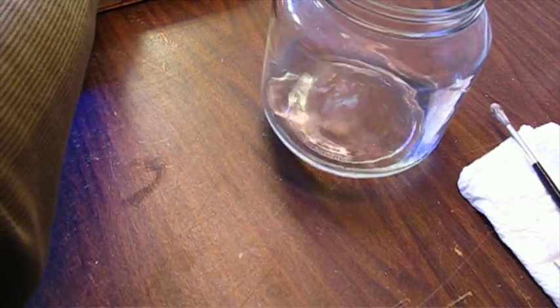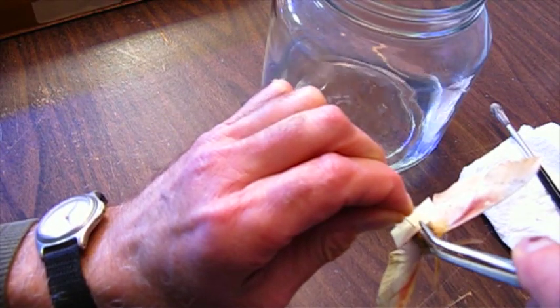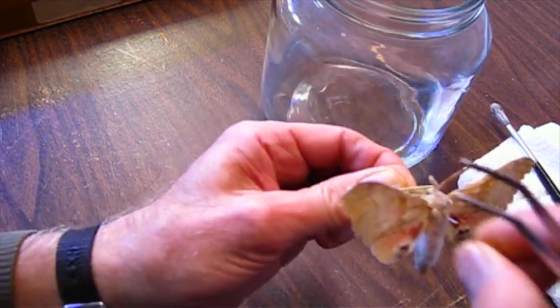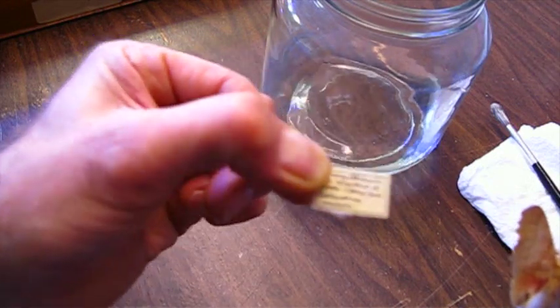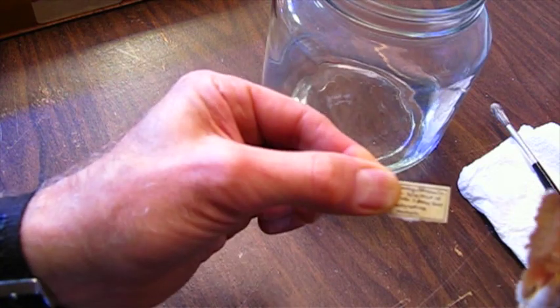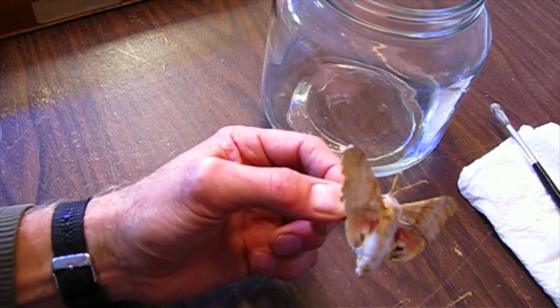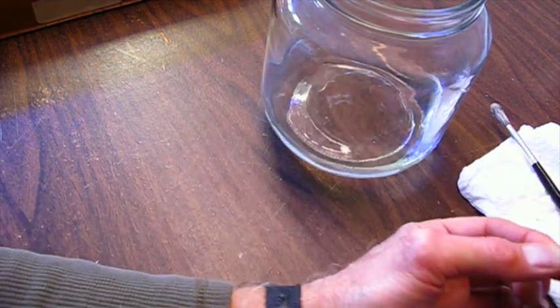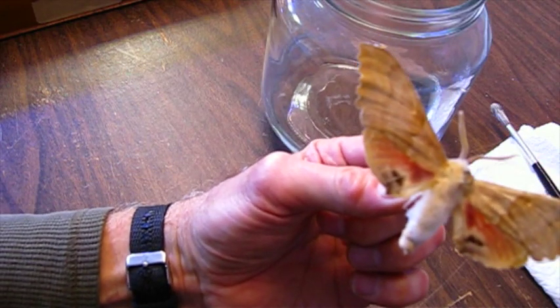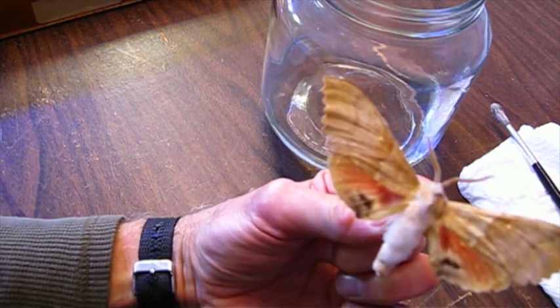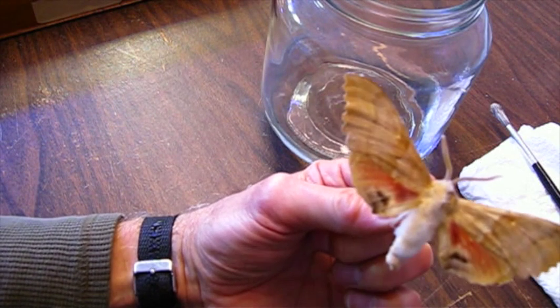First thing to do is I'll remove the label, the data label from the specimen. You can see even the data label has some mold on it, it's kind of discolored, so I'm going to replace it and make a new label. This is a specimen of Pachysphinx modesta, a sphingid moth, collected in Gillette, Wyoming, 2001.